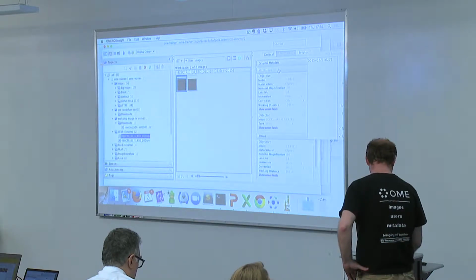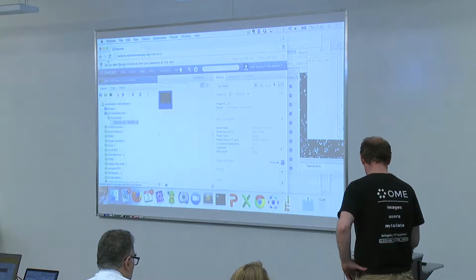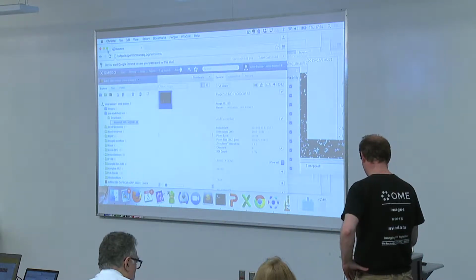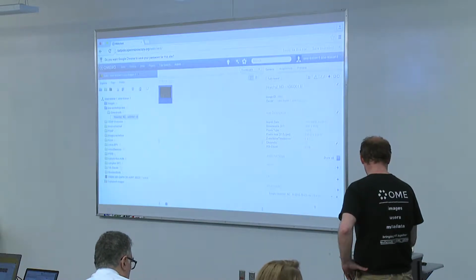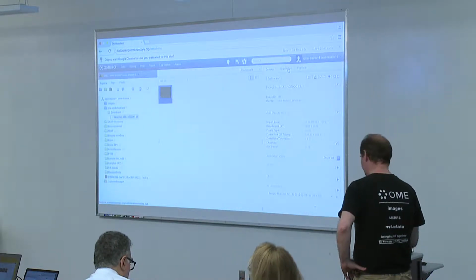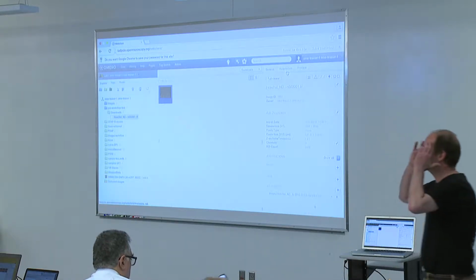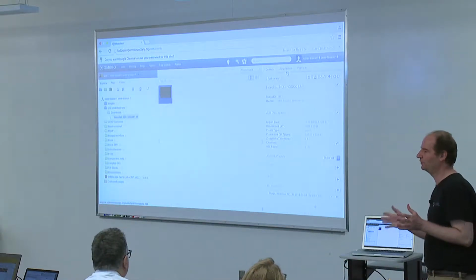So let me show you that. I took OMERO Web short because of the technical problem we had here. I'm really sorry. It's just, yeah, just to make clear what is actually the server and what to think about that.